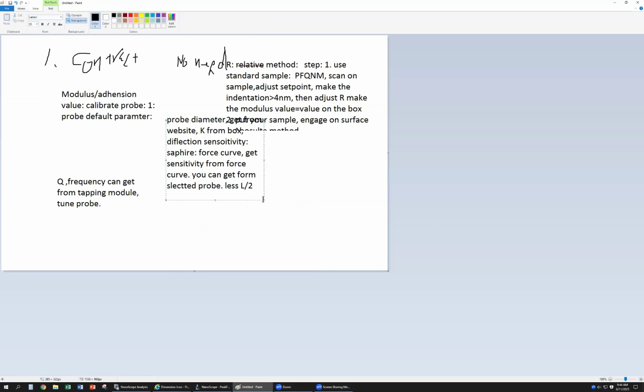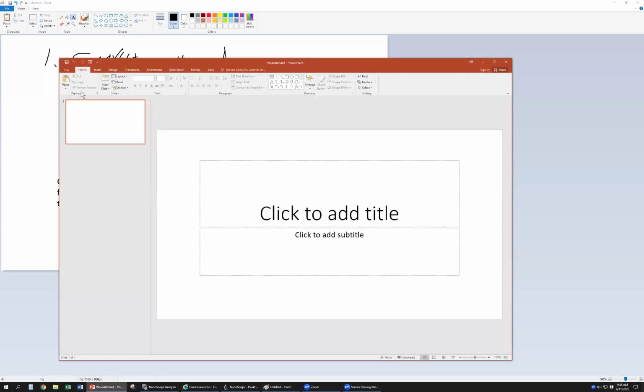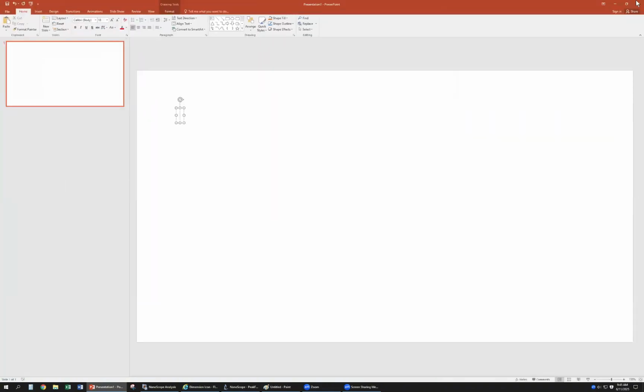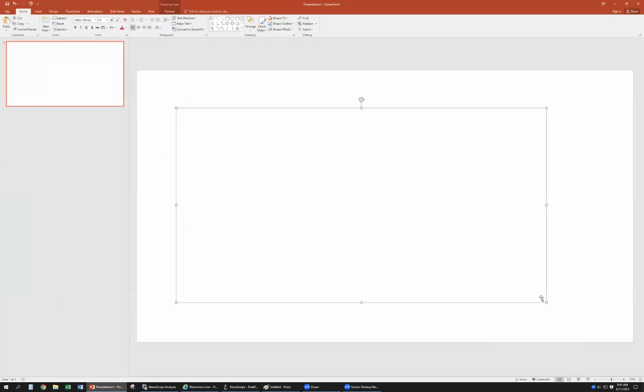Just copy this one to here. Okay. Then continue, huh? Okay, so this one is correct.